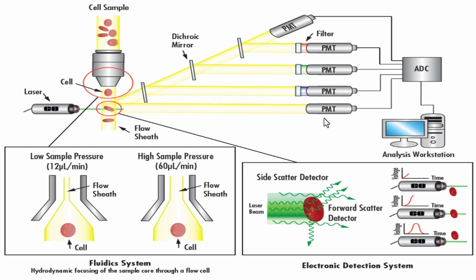And then this diagram here is much more in detail than the diagram we previously looked at down here. Essentially, we're going to have the sample be inserted into the collection vessel, and then, as mentioned before, a laser will be passing through the sample, and then that laser will eventually make it all the way to one of these photomultiplier tubes. And then there are a series of dichroic mirrors depending on the instrument setup, and then eventually it's going to be passing through an electronic detection system and then to the software of choice. And then this is a little bit more in detail on the fluidic system, but we're going to cover that in a different section of the presentation.